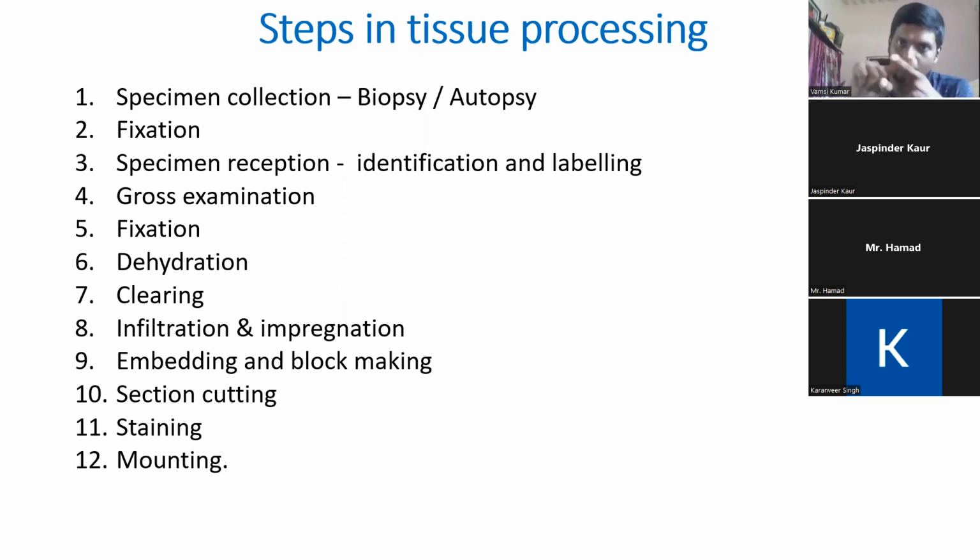Does it have a fallopian tube? Does it have fimbriae? Does it have a suspensory ligament? Does it have an ovary? If it is an ovary, we also need to identify the positioning of the organ. Is it the right ovary? Is it the left ovary? So we need to identify the orientation of the organ also. If you have any problems in identifying the orientation of the organ, immediately call the doctor: Sir, is it a right ovary or left ovary you sent? So we need to also record the associated organs that came along with the specimen.